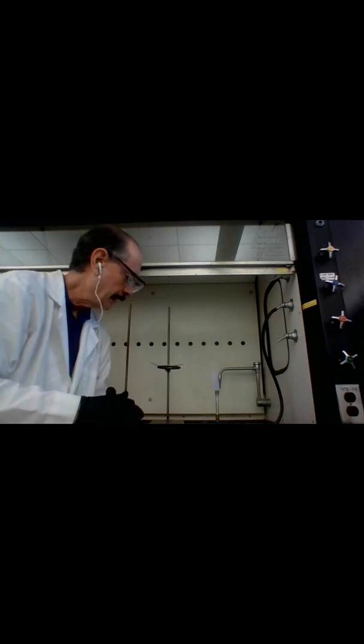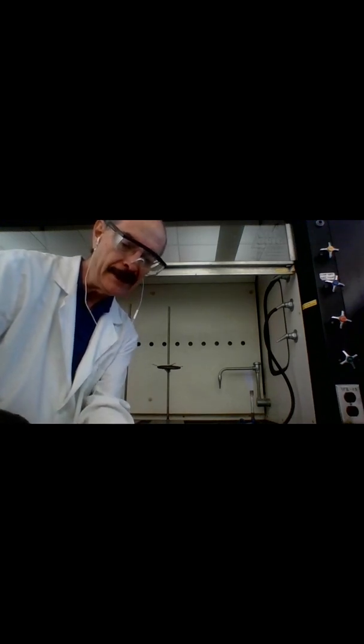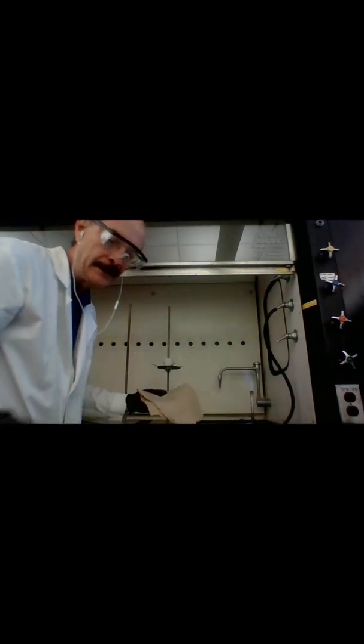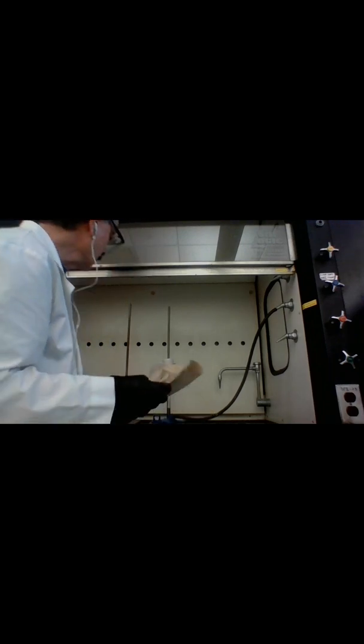Here in the fume hood where we'll be performing our experiment, I have my Bunsen burner set up. I have a ring support and a clay triangle placed in it. Now I'm going to bring in my crucible — remember, always handle it with crucible tongs and a paper towel underneath. I'll place it on the clay triangle and bring in the Bunsen burner to heat it for a few minutes, just to clean it in case there are any residues from previous use.